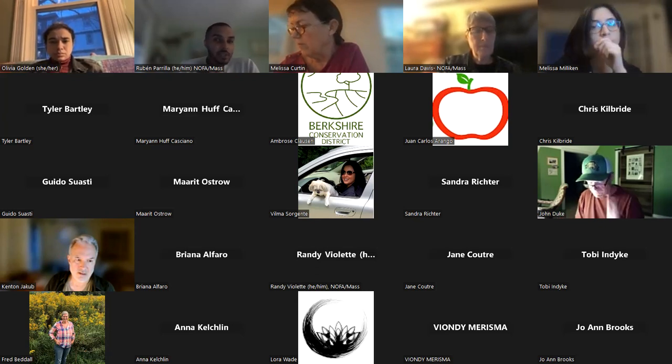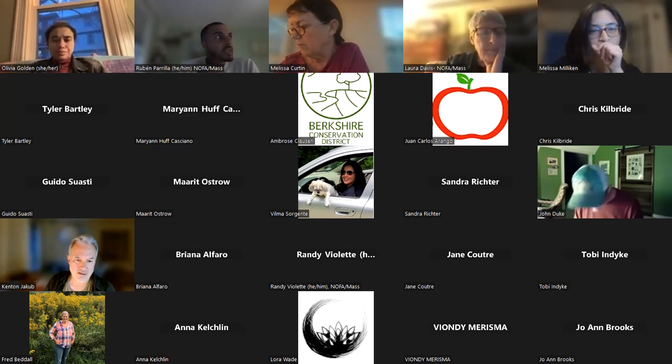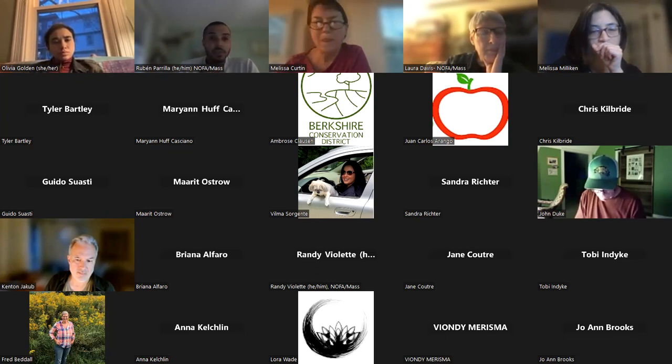So that's another aspect of microscopy you can use, not only to evaluate your microbial population, but also to see whether that mycorrhizal inoculum worked. Anything else specifically on mycorrhizae?